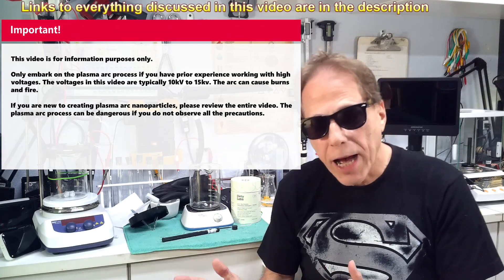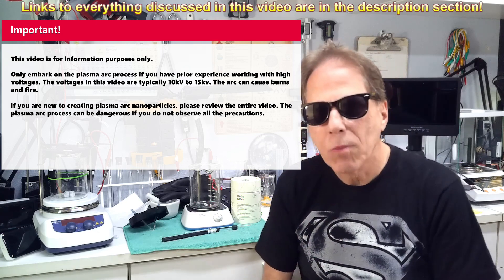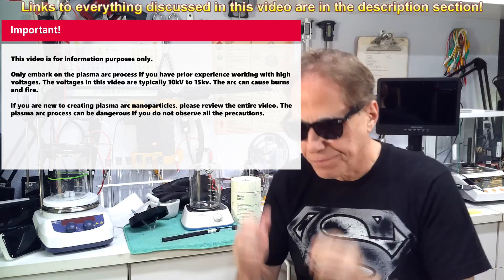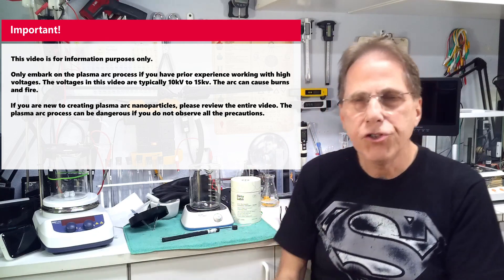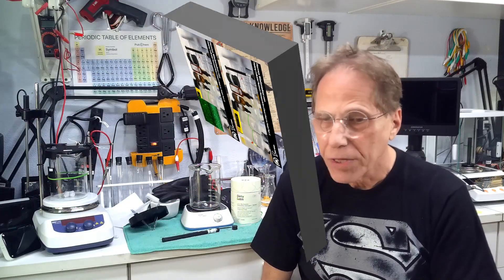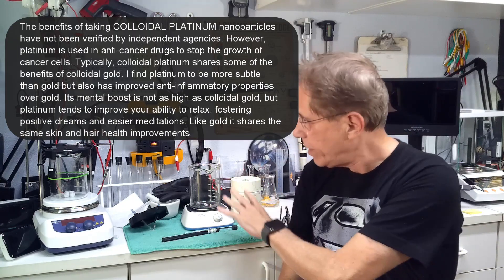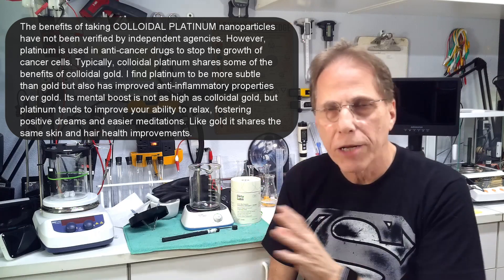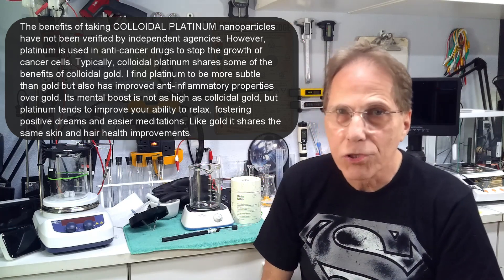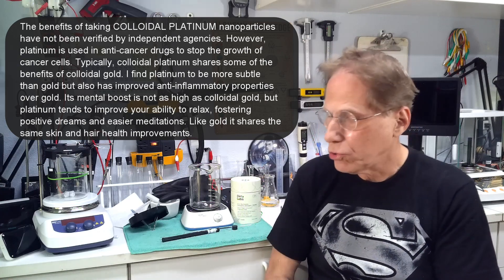Welcome to Reality Creative Video, I'm Hermes or Tom. Today we're going to cover a start-to-finish on platinum using the plasma arc instead of low voltage DC. If you've used my low voltage DC method, you'll know it's long, involves chemicals, raising pH, lowering pH, and the yield is not that high. Plasma arc is much simpler — put it in the beaker, turn on the process, and 20 minutes later you've got a 20 parts per million platinum solution. Cook it for 40 minutes and you'll have 40 parts per million.